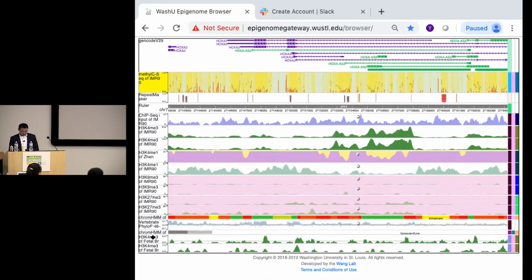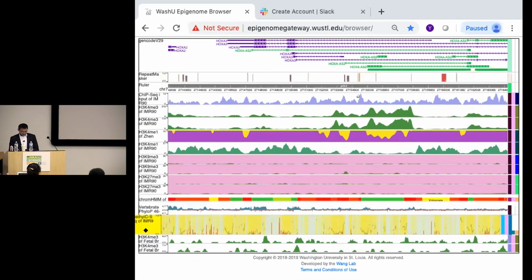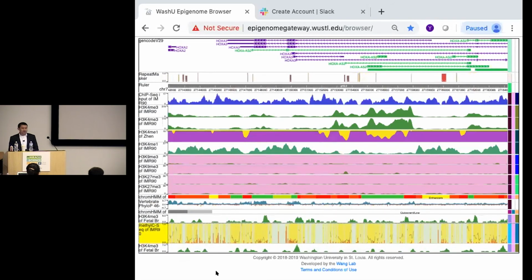I'm going to move one of them up, move this one down, like for example, right? So I did a bunch of other manipulation, or that's how you do research, right? You play around and then, whoa, I like this view even better.